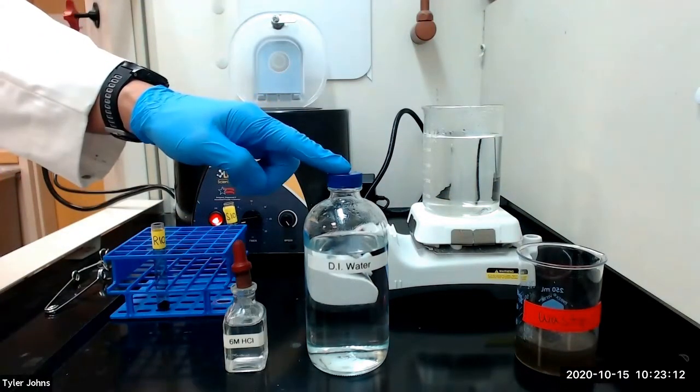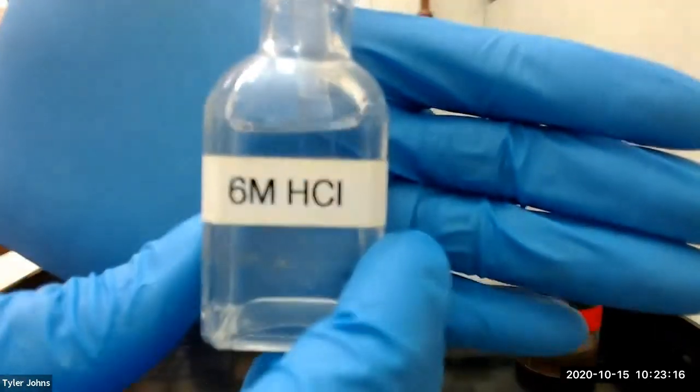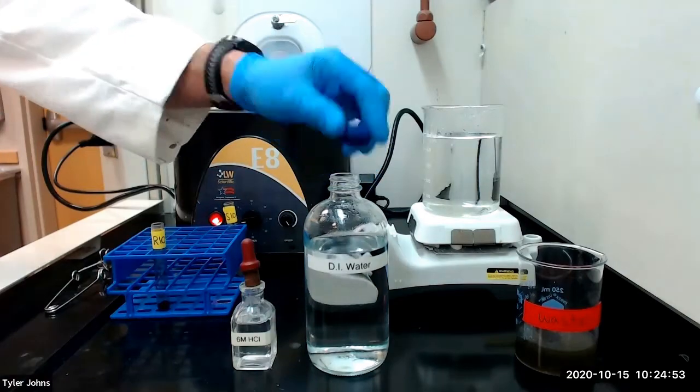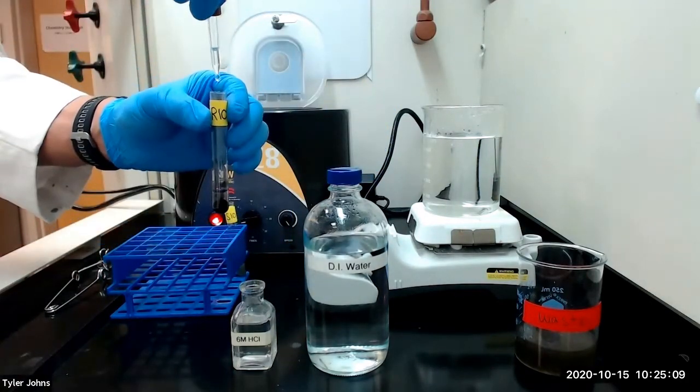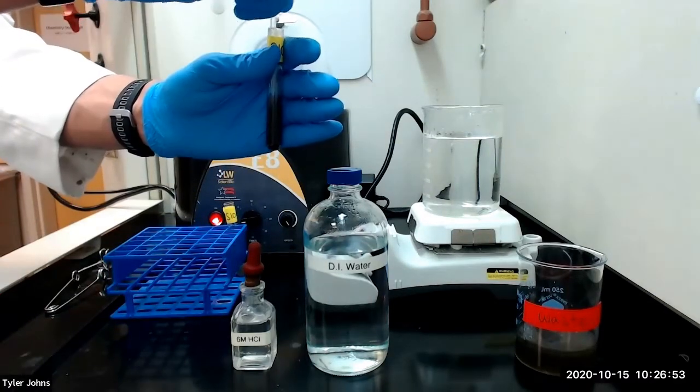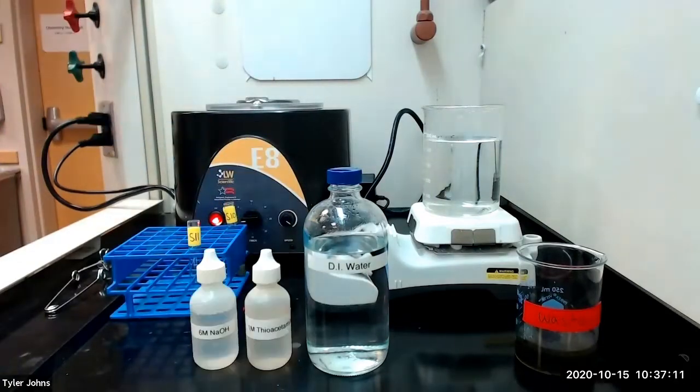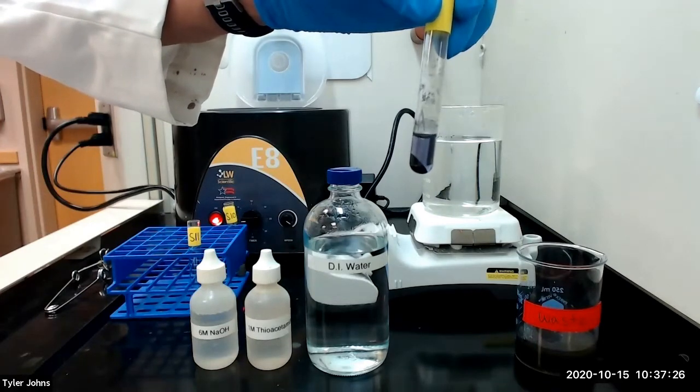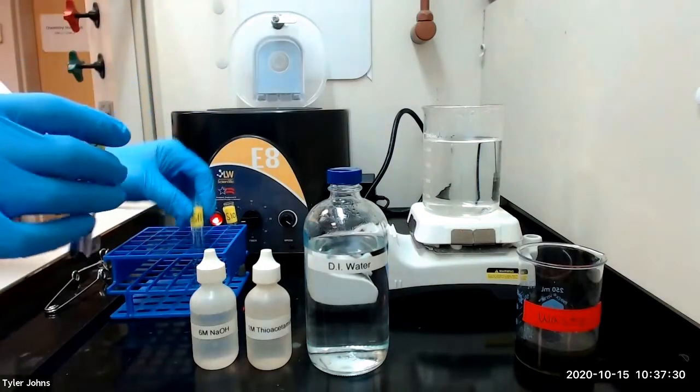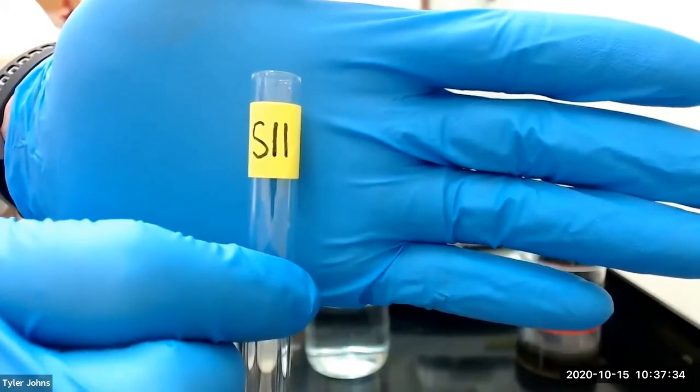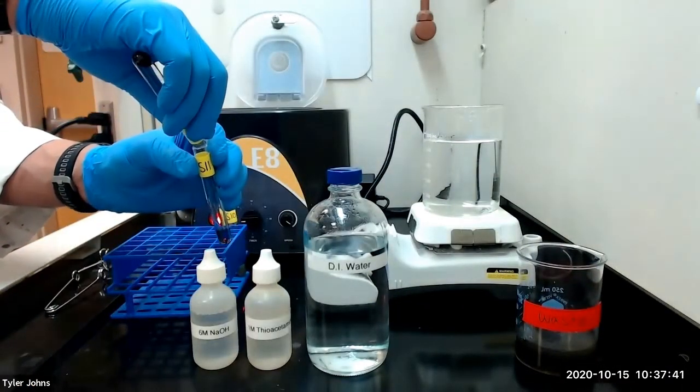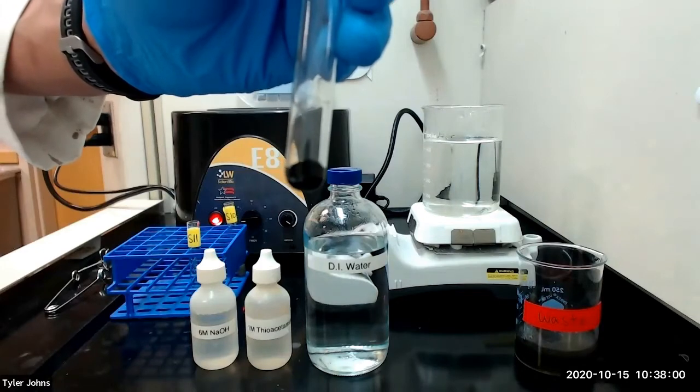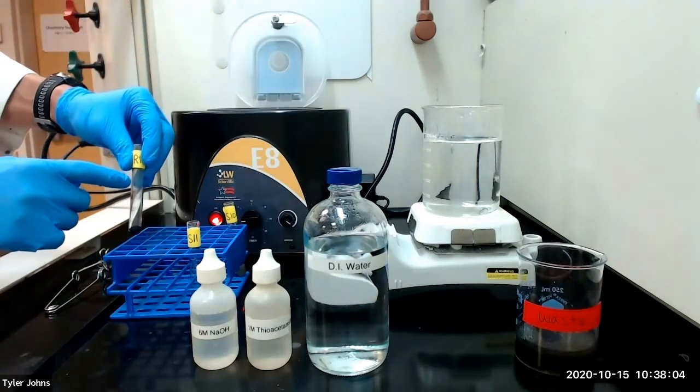We will next add 1 milliliter of deionized water and 2 drops of 6 molar hydrochloric acid to residue R10. We will stir for 1 minute and centrifuge. This is what our mixture looks like after centrifugation. We will now decant the solution into a new test tube labeled S11. We will save the residue for analysis of nickel and relabel the residue as residue R11.